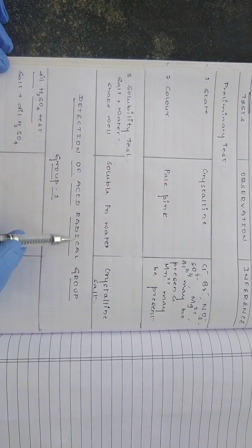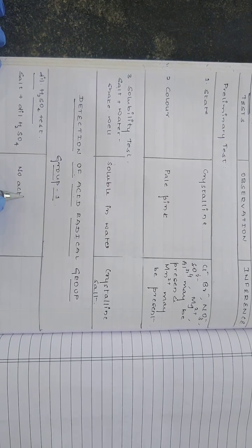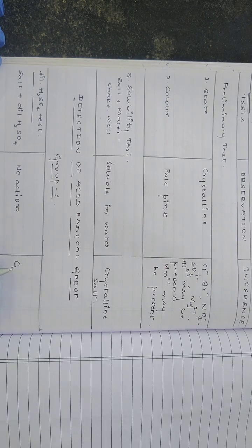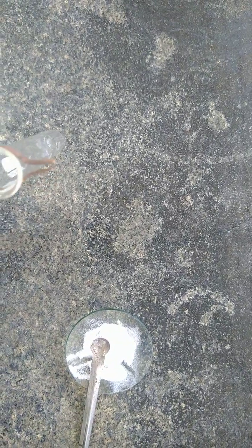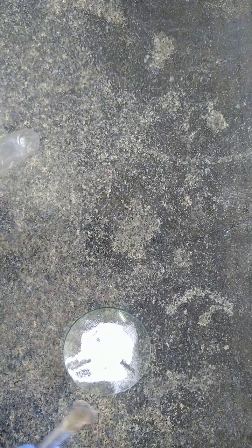So we will note it down in the book. Detection of acid radical group. Group 1, dilute sulfuric acid test, salt plus dilute H2SO4. We are getting the observation as no action. So the inference is that group 1, that is carbonate, CO3 2-, is absent. Because group 1 is absent, we will go for group 2, and the name of the test that we are going to perform is the concentrated sulfuric acid test.